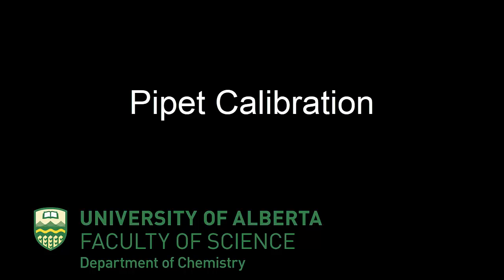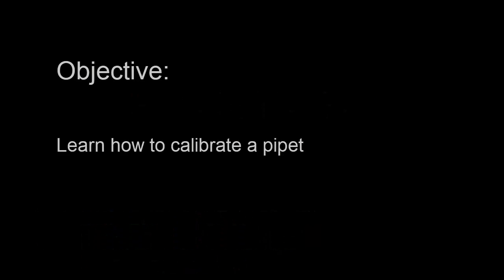Pipette calibration. The objective of this video is to learn how to calibrate a pipette.